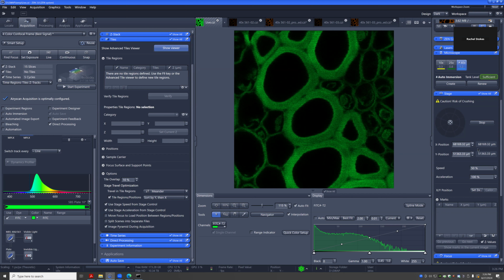So it's just good to have that in mind, or make sure that you know where this is, and then change it if you see any effect. I think as a default, this will be set to 100, but if you see anything where your sample wobbles or you think it's not as stable, this will really help to get a nice stable stack and no movements at the top of the scan. So yeah.